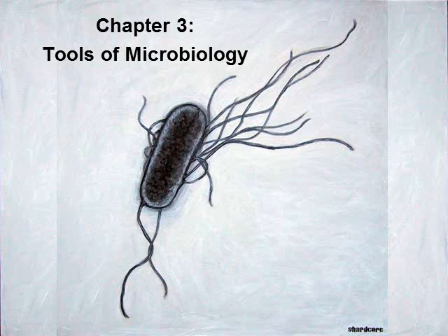This is part 1 of 2 on chapter 3, Tools in Microbiology. This chapter is going to go through some of the techniques and tools that we're going to be using in lab. So we're going to be reviewing these throughout the semester in lab.